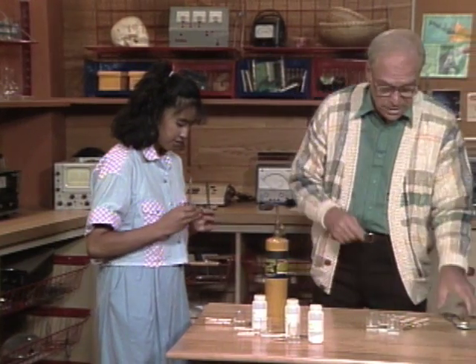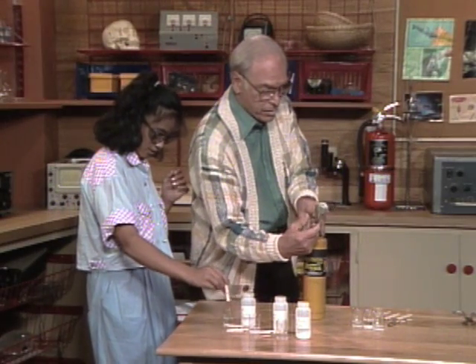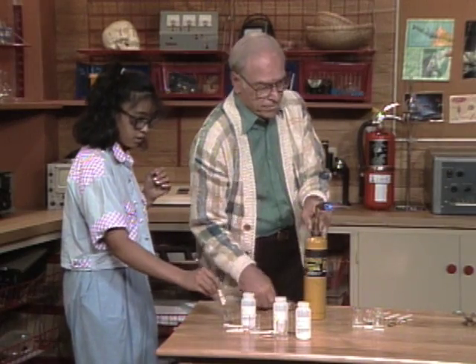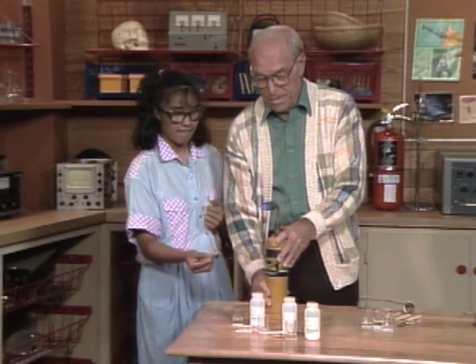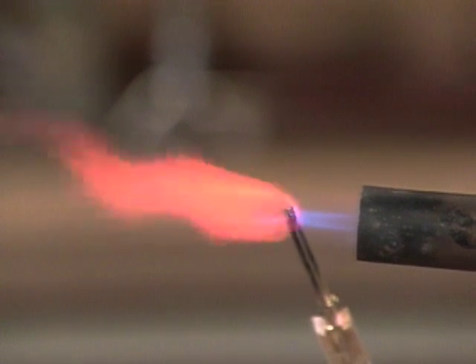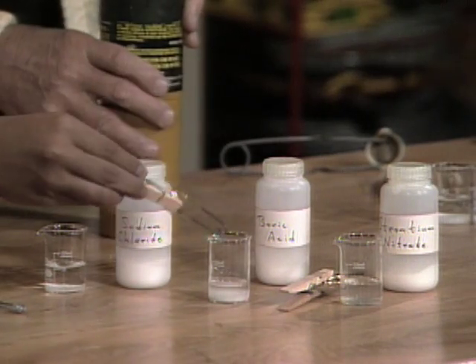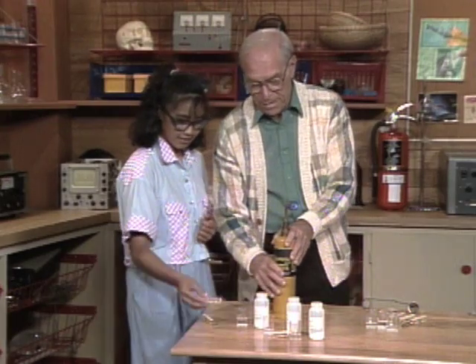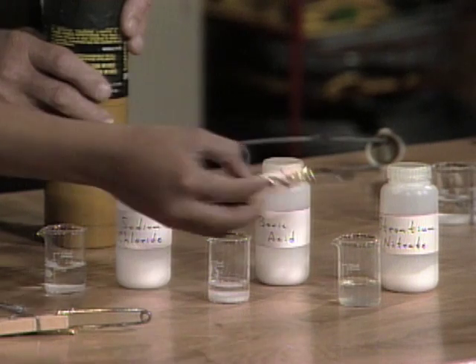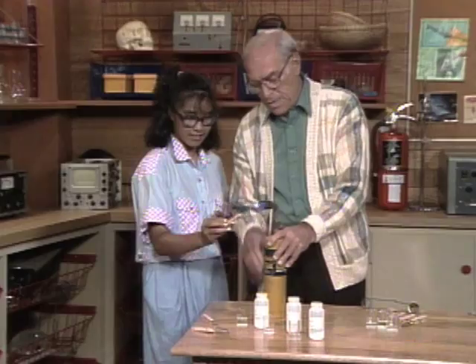Put on the safety glasses and I'll get the blowtorch started. Dip it in the first solution. Hey, it's yellow! Okay, so put that one down. The next one is green. And the last one is orange — sort of orange, sort of red.